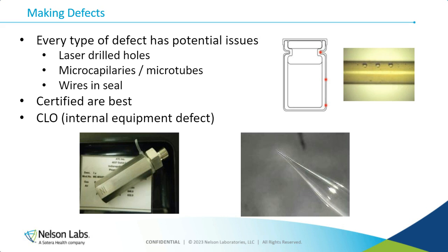We've used those before. They're kind of like a GC column tube, and so it's got a uniform diameter inside. But as you're cutting it to make a little sample, because it's on a big reel, you could get shards inside, and you have to be careful about the length for the same reasons that I just discussed.